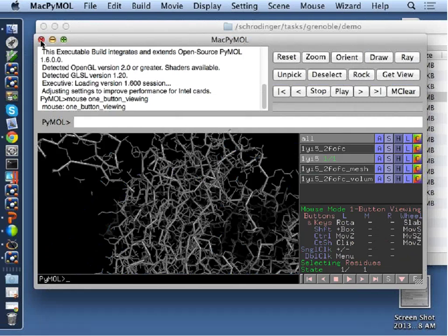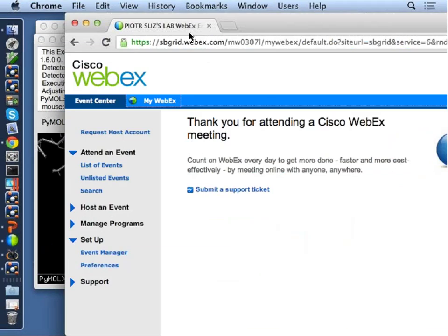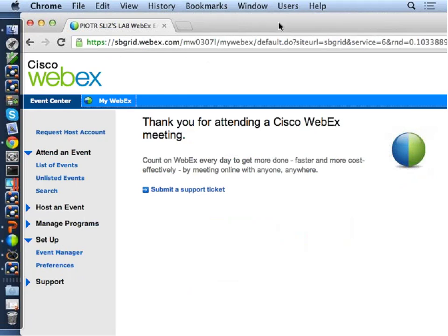So I have a question from the audience, if there is a wiki page with the information on how to make a movie. Yeah, there is. As I said, this will be much easier in the next release because it will be in the menu. It will automatically align the atoms. Because for morphing, of course, if you have 2 input structures, it's crucial that they have exactly the same topology. And often people use similar structures which are not identical, but we do this by internal alignment and matching, and this is then all done from the menu. So far, if you want to do morphing, you have to do this yourself.